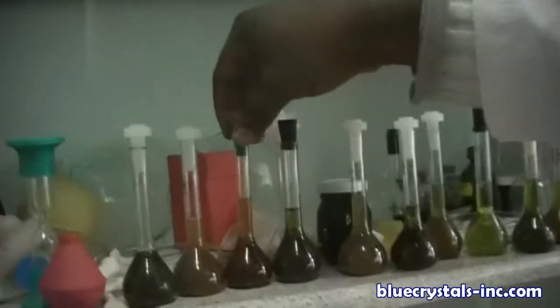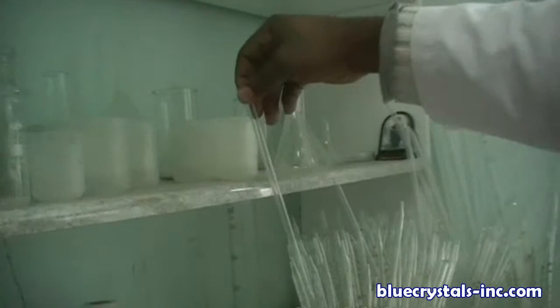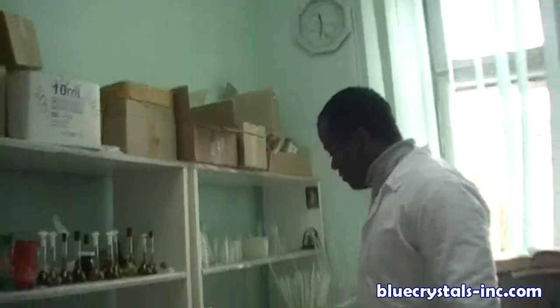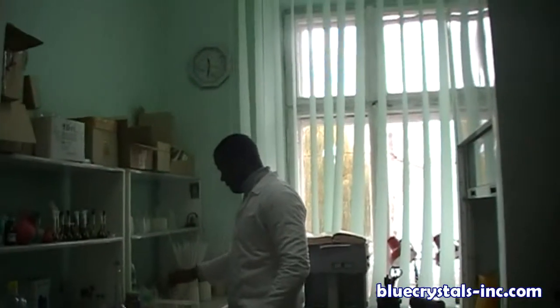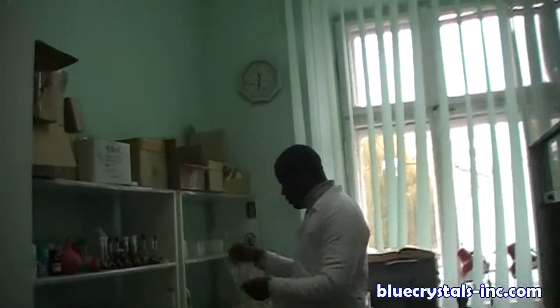You store in conical flasks. And here you have your beakers. This funnel. This beaker. These pipettes. And this is your rack for your pastry tubes. This is the rack.